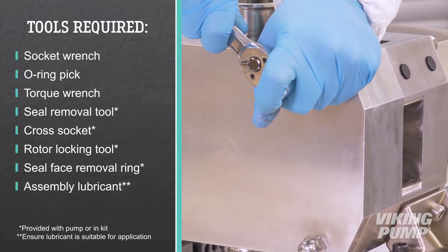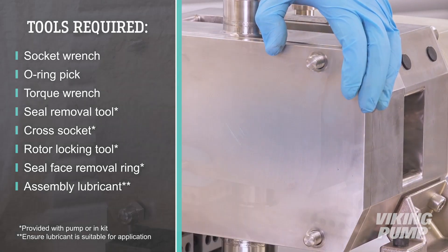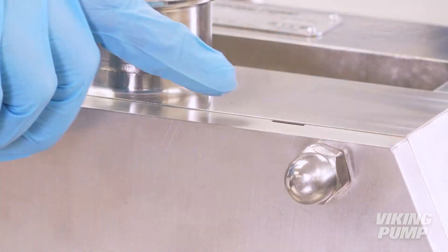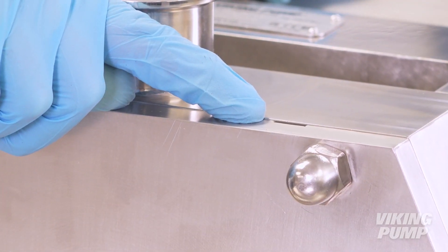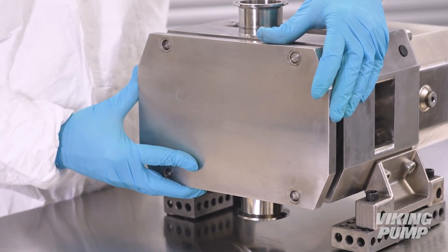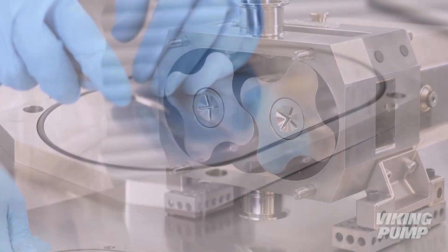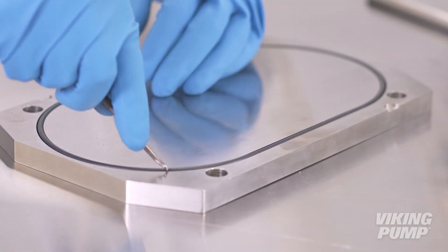To begin, loosen and remove the pump cover dome nuts. Remove the front cover — ears or cutouts located on the cover can aid in removal. Remove and discard the pump cover o-ring.